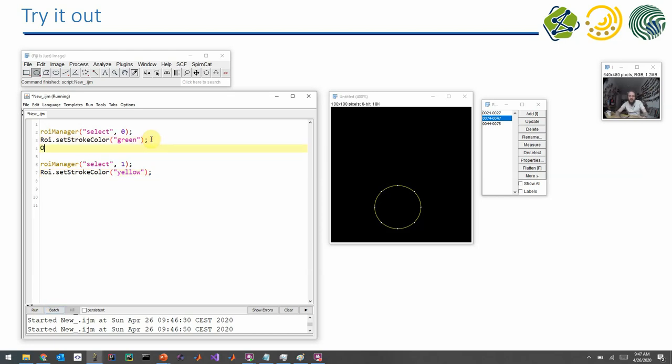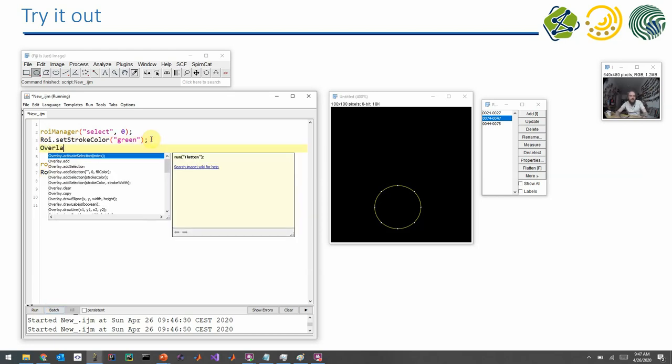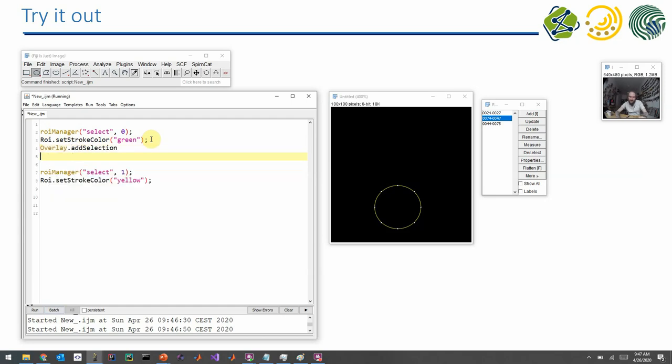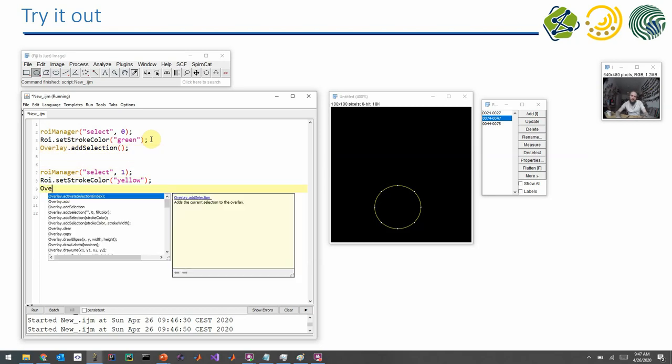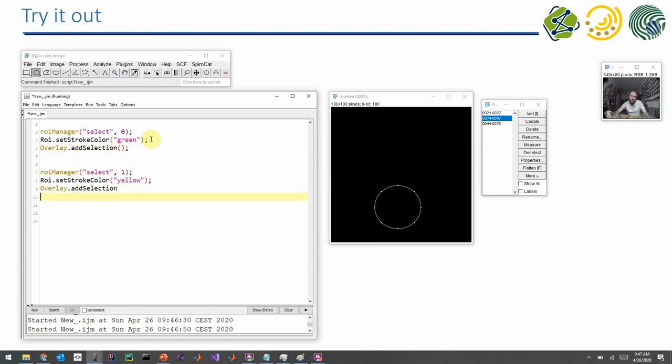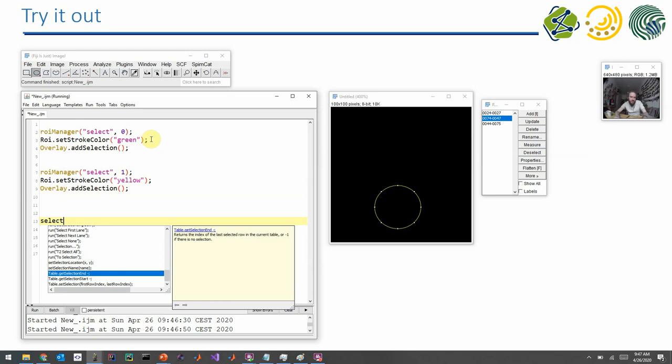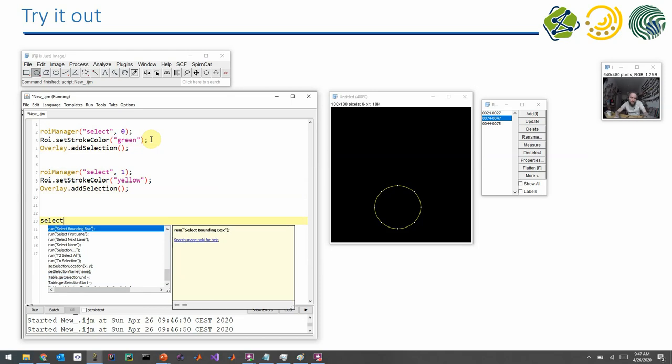This is what the overlay is for. It has to add it to the overlay. And the command for this is overlay. And you see, I just go through this pulldown here and it has a command called add selection. So I can add the current selection to the overlay.